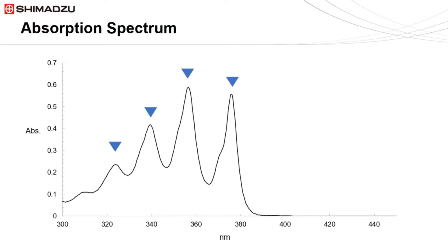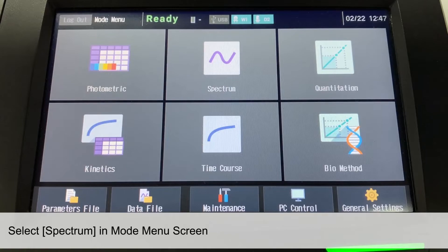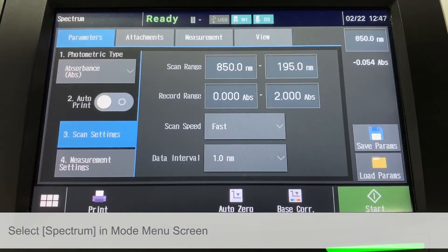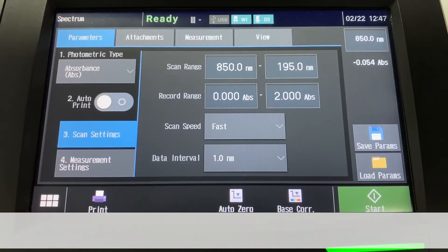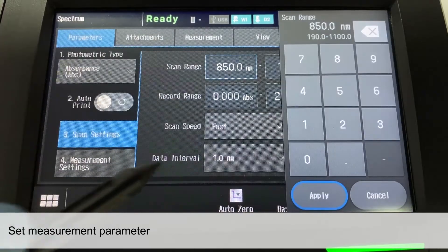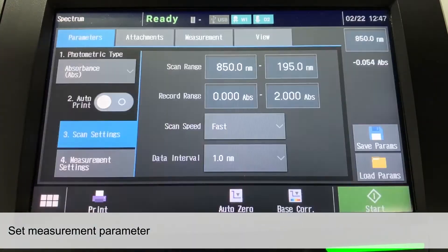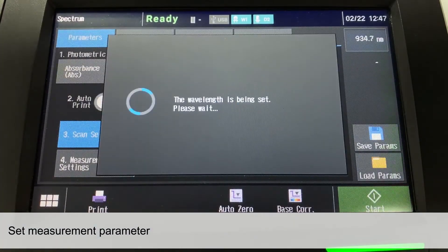Let's look at how the UV-1900i is used to measure the spectrum of a liquid sample. From the Mode menu screen, we will select Spectrum. Set the measurement parameters required for the analysis, such as wavelength scan range and photometric recording range.